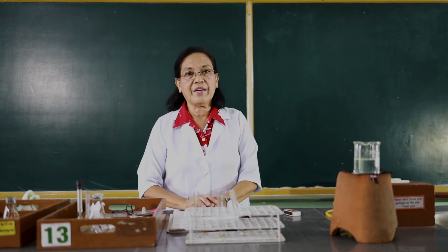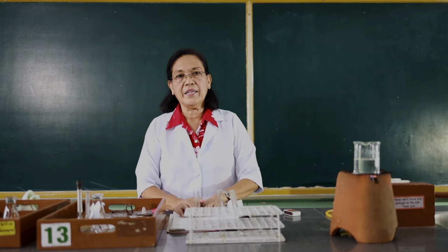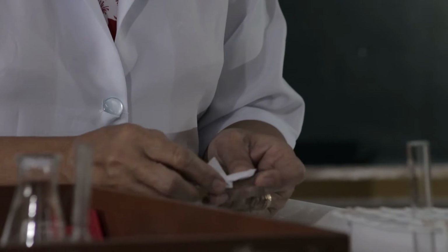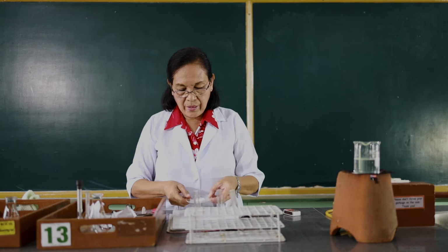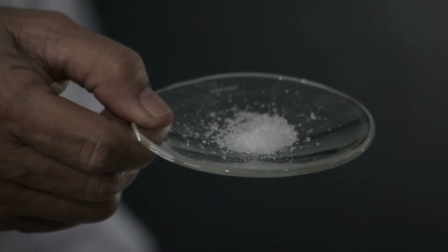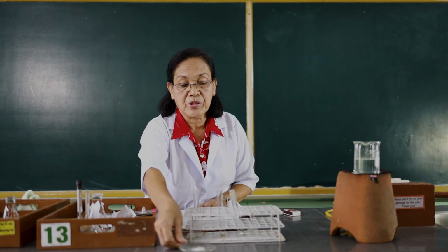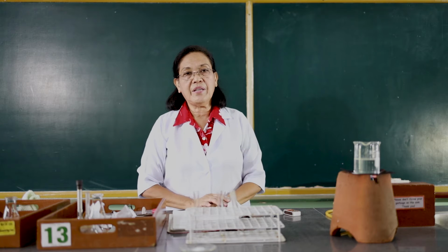The next procedure is we are going to expose the anhydrous zinc sulfate into the atmosphere. This is the zinc sulfate, and we will expose this to the air or to the atmosphere for some time, and we will observe that later.